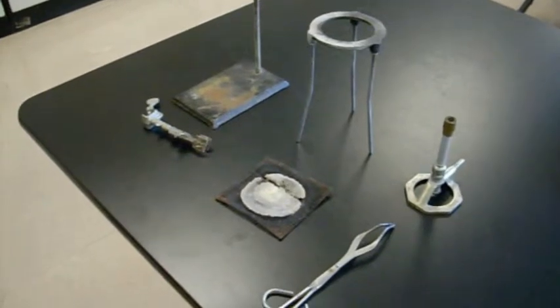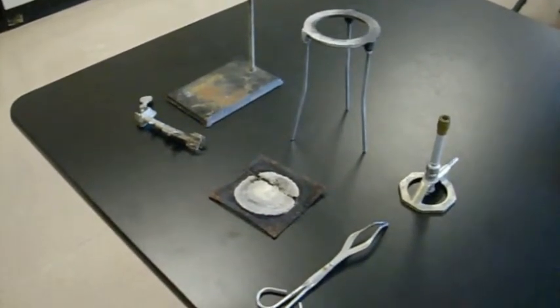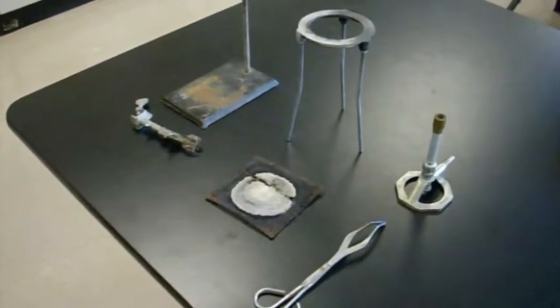The purpose of this video is to familiarize you with some of the materials used in the Dumas tube experiment for advanced placement chemistry.